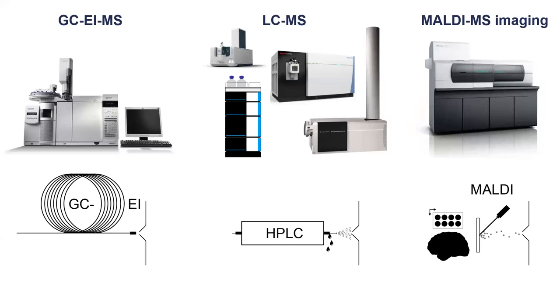So yeah, interesting. And then of course something more specific is imaging, who use imaging techniques. Okay. So we see it's less people. Oh, that's interesting. I think only 5 in total. So we see we have different platforms that you can actually use. We see GC and LC are the most prominent, I would say. And imaging is very specific, but it's also a very nice field. So yeah, I also work a lot on imaging, so I also like this topic as well.